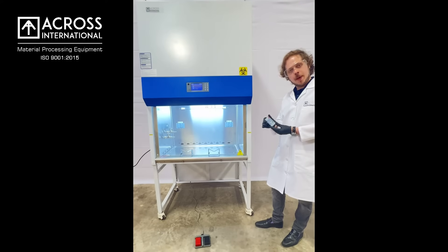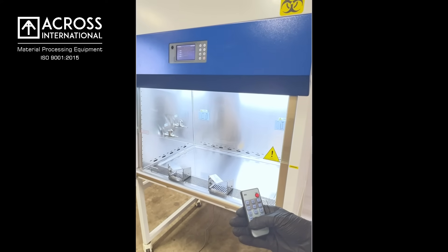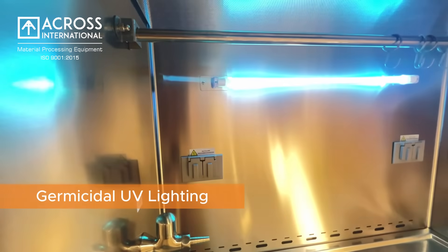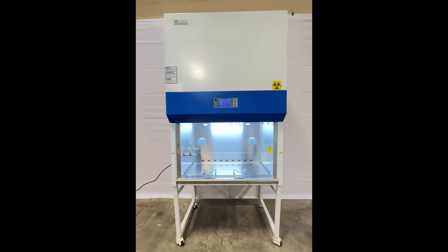Each Across International biosafety cabinet comes with a remote control that can be used to raise or lower the sash, as well as control the LED and UV light, and shut on and off alarms that are triggered to alert your lab space of any issues that you may need to address.